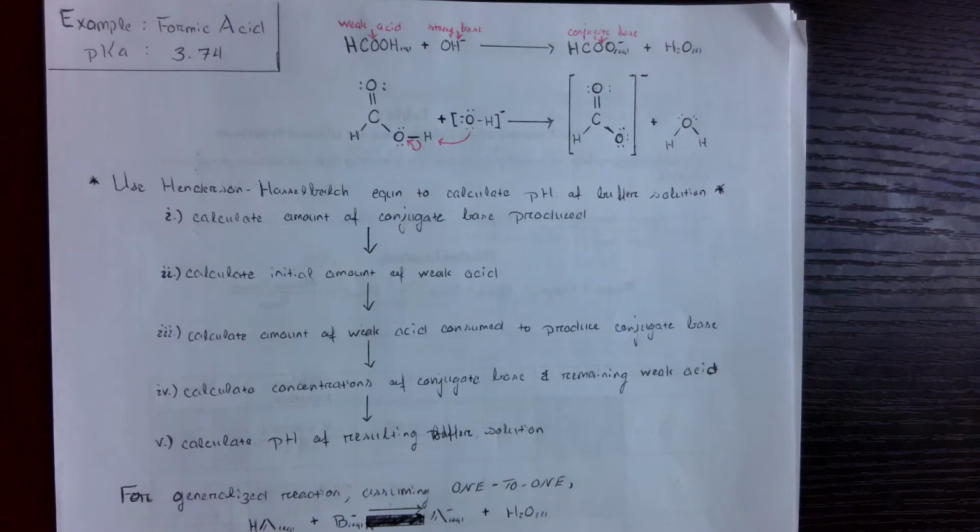Part 1, you're titrating with a strong base to make the buffer solution. Part 2, you're titrating the buffer solution you made with strong acid. So part 1, strong base. Part 2, strong acid. The strong base is only used to make the buffer solution. The strong acid is how we monitor changes in its pH.